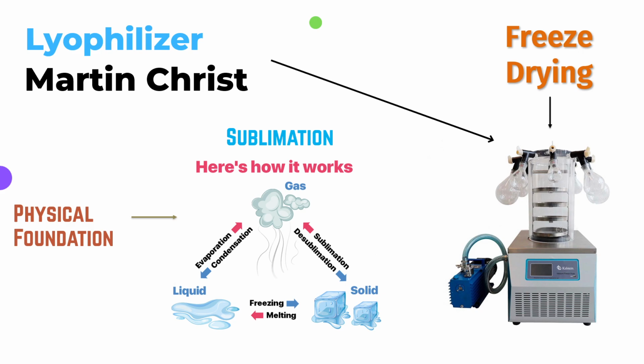For the process of sublimation, there is a requirement of a vacuum environment which will be created by the vacuum pump. So the function of the vacuum pump is basically to create a vacuum in the system which is required for the sublimation process, where there will be conversion of a solid directly into gases by omitting the liquid state.